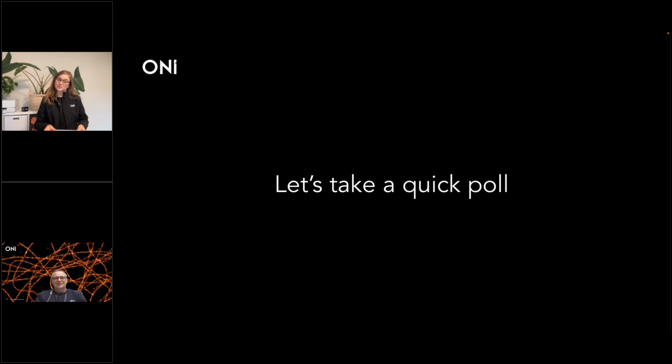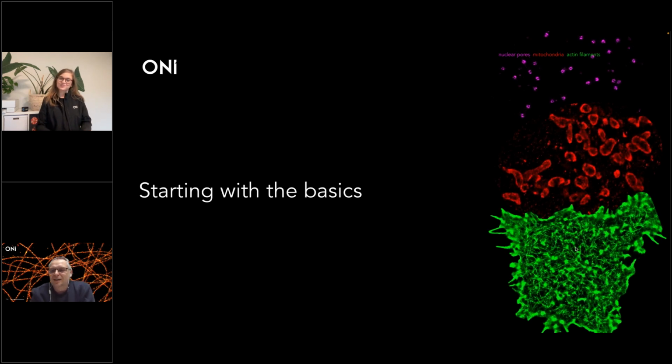Okay, so that actually sounds really good. But as we start, I would like to just give you a small recap about the basics if you didn't attend it yesterday. So then we just give you a small introduction to single molecule localization microscopy, and we will start from there after.